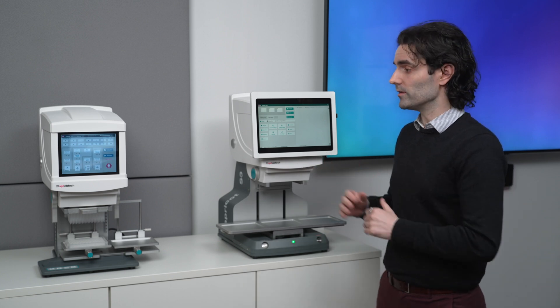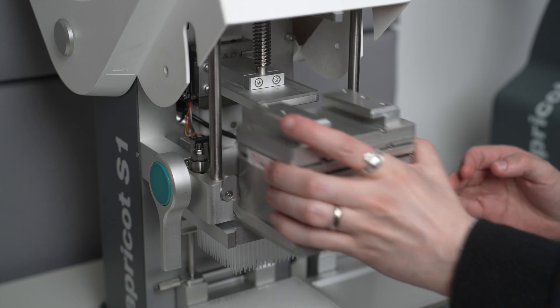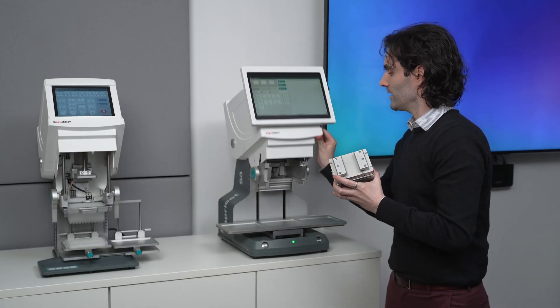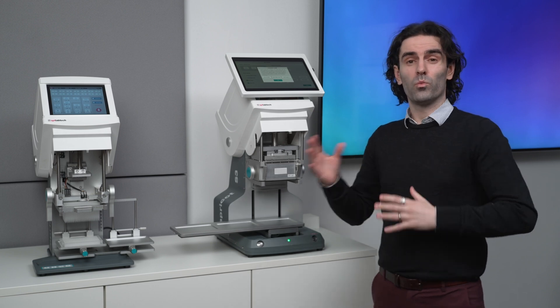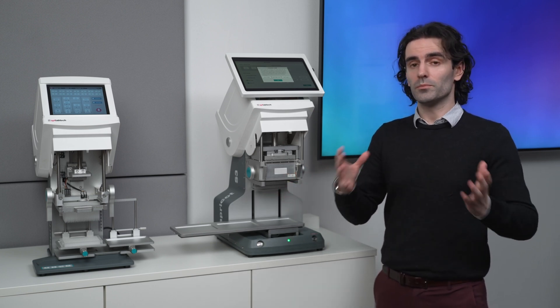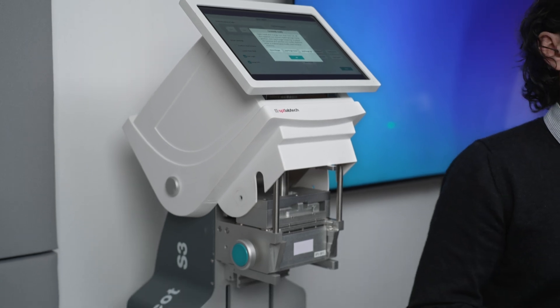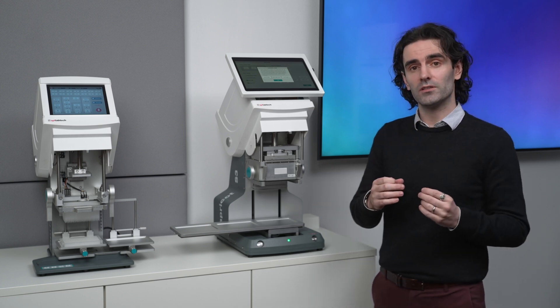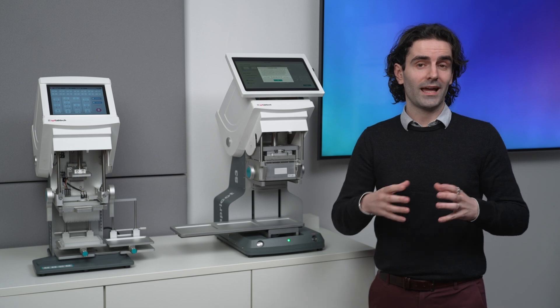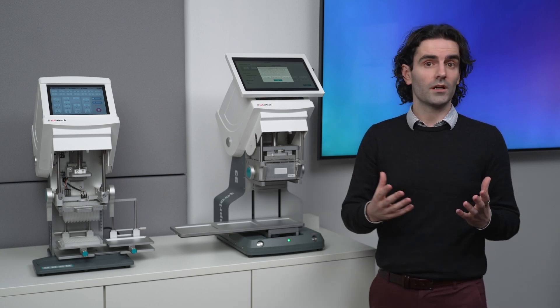One of the really cool things about both of these instruments is that I can go over to the S1, simply lift this up, take my pipetting core, and slot it into place on my S3. So with one instrument and three cores, you can cover multiple plate types and a broad volume range — and you can even share these cores between the two instruments. The S3 can be better suited for more complex liquid handling tasks where you need the additional deck position or more than one liquid handling step. We have a lot of customers who use it to automate simple kits.